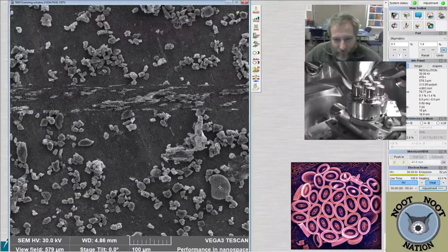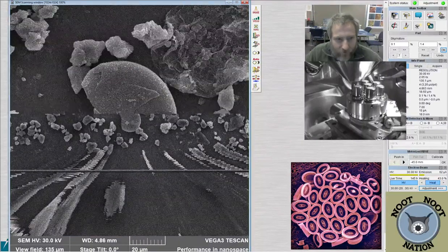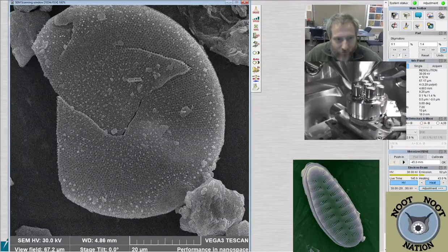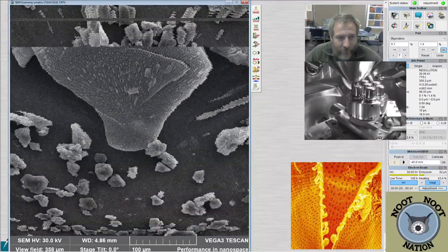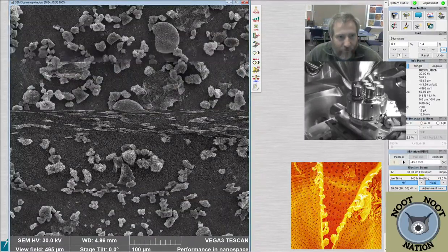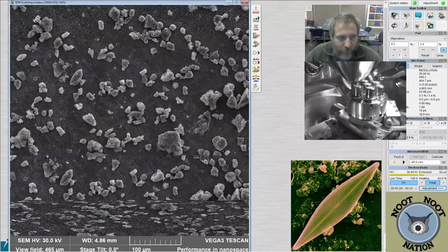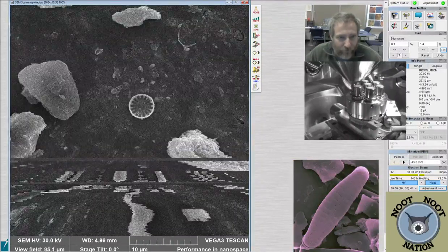Probably, it's another Pleurosira, it looks like. This one's a little broken, so not quite as nice as the one that we saw before. It doesn't have any junk on it, or not much. Again, there's the hole for the rimoportula. Here's the ocelli. All the features are here. It's just cracked. You can see there's a big, giant fracture in it. Yeah, it's about 50 to 60 microns across. They can get even bigger than that. I think they can get up into the hundreds of microns on occasion.